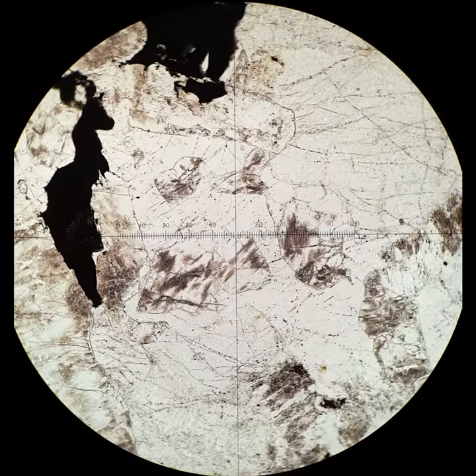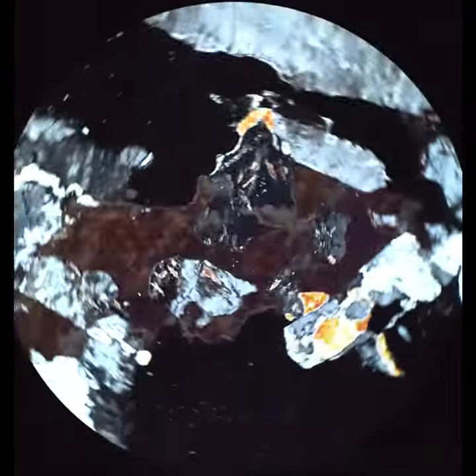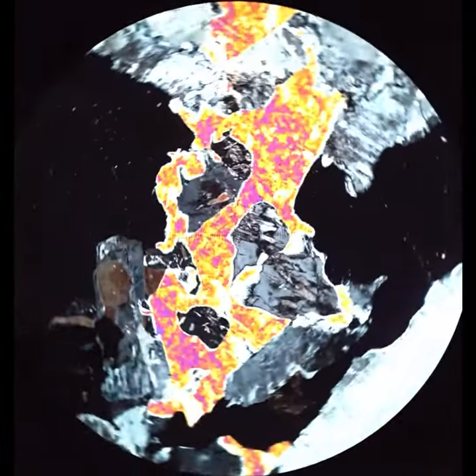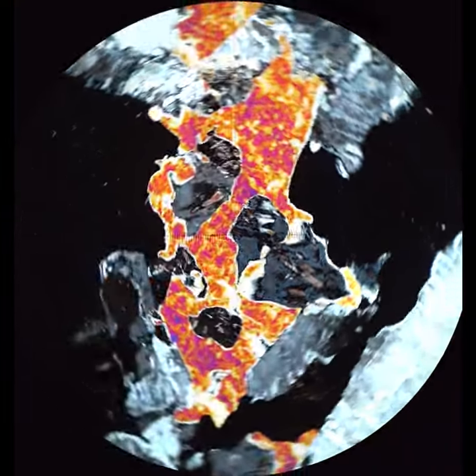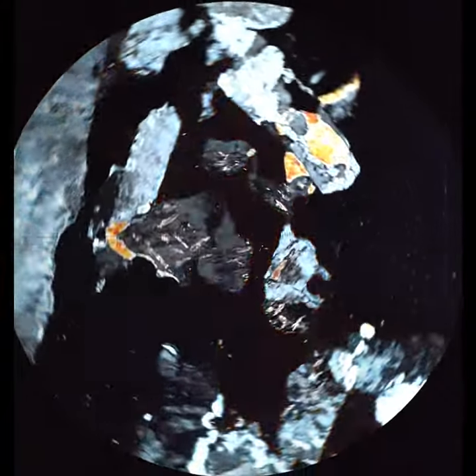When I cross the polars, you'll see it's this red and orange and magenta high birefringent mineral. The other stuff in there, the black is sodalite, it's isotropic, and then there's some gray k-feldspar with the mottled interference colors.